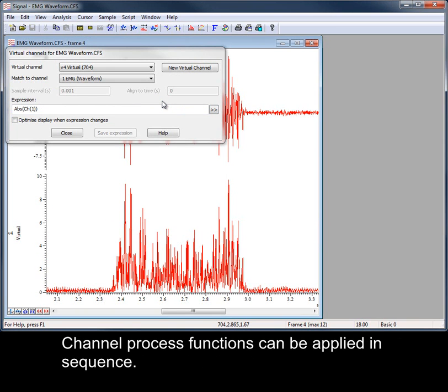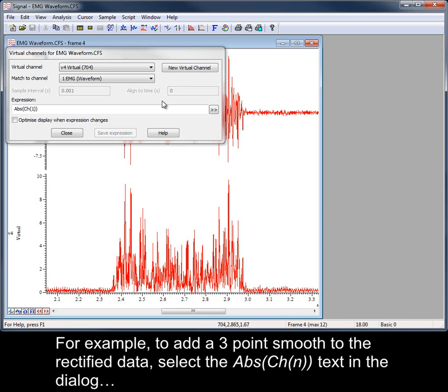Channel process functions can be applied in sequence. For example, to add a three-point smooth to the rectified data, select the expression text in the dialog.